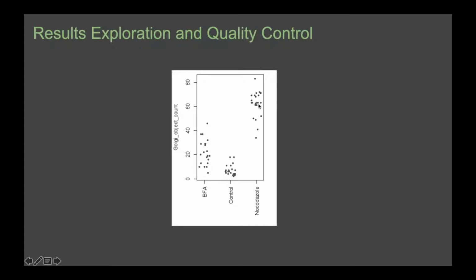And if I look, so can you actually see my mouse pointer here? Yes. Okay. So to reach statistical significance, there are two things that play a role. One is the difference between the average values. If the difference between the average values is very high, then you reach statistical significance quicker. And the other thing is if the spread, so the sigma, is very low, you also reach statistical significance quicker. So basically how many images you have to take is a function of the difference between the means and of these two sigmas. So you can't actually know how many you have to take before you make this plot at least once.